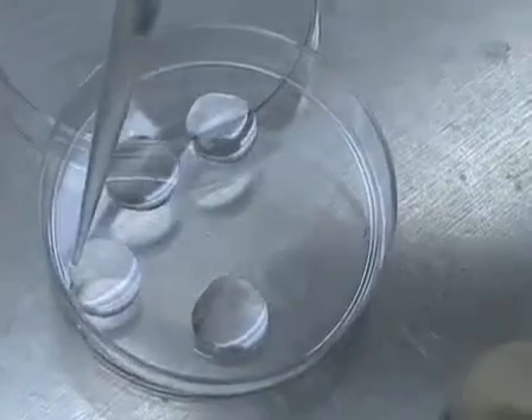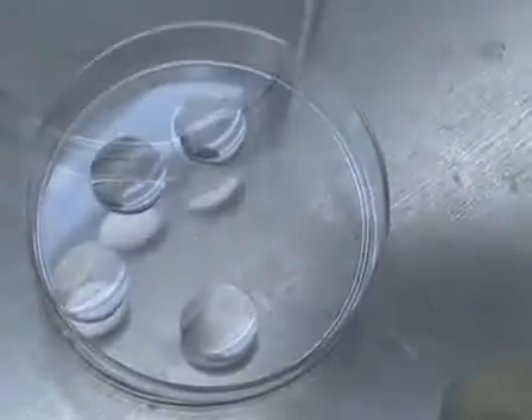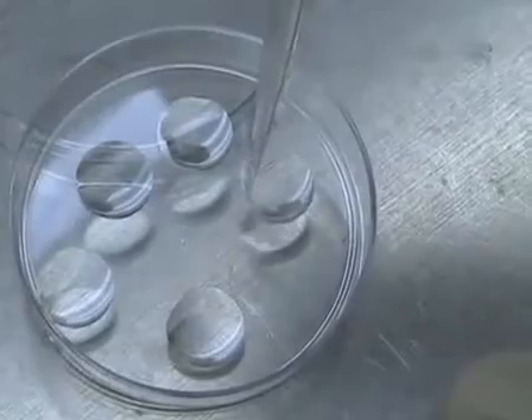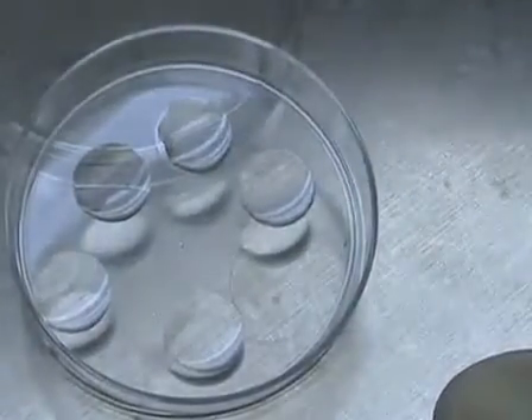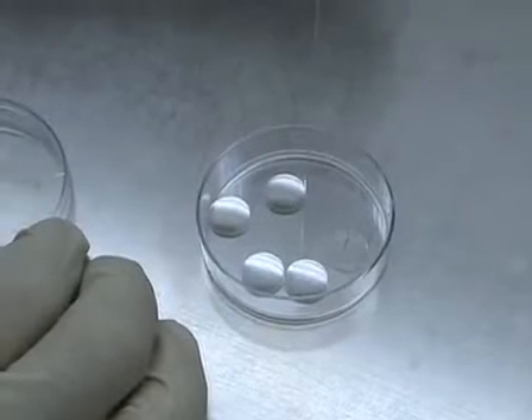All right, we are at the point where we can remove the brain and start doing the actual dissection. But before, it's important to mention that the cover slips that you want to plate these cells in need to be coated. We usually do that overnight at room temperature at a polylysine concentration of 0.1 mg per ml. The next day we come and remove the polylysine and wash the cover slips three times consecutively.